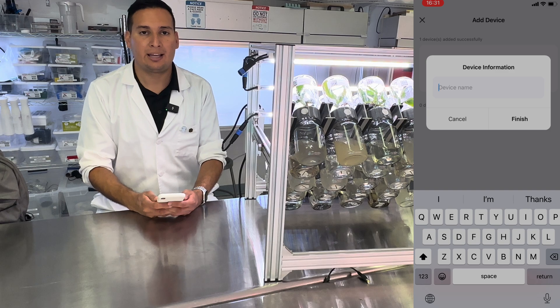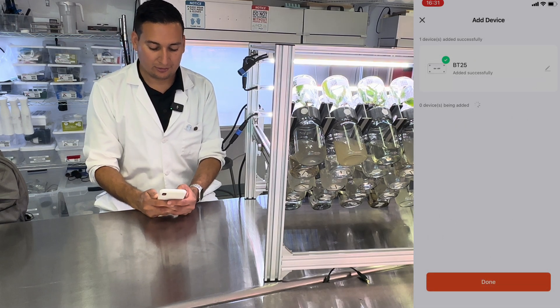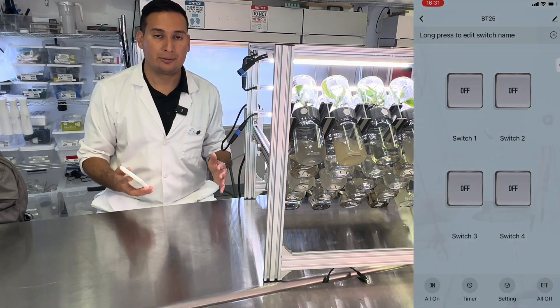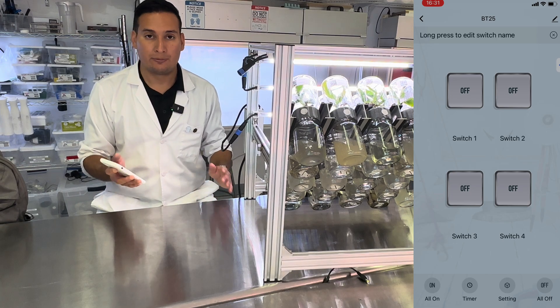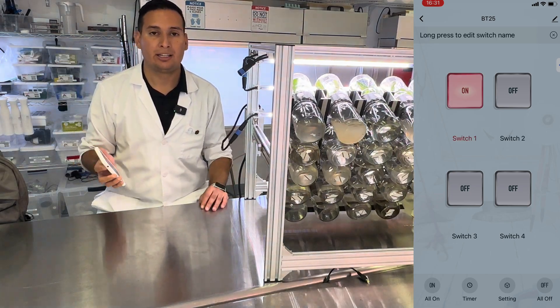The controller has been added and now I can change the name. I click finish, so now the device is ready to go. Now we need to program it. The device has been added to the app, so if I wanted to, I can just hit a button and it's going to manually turn.